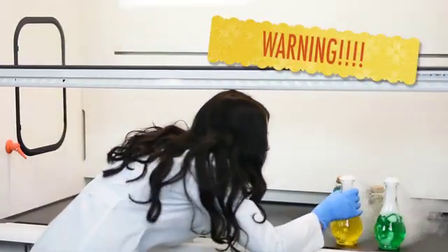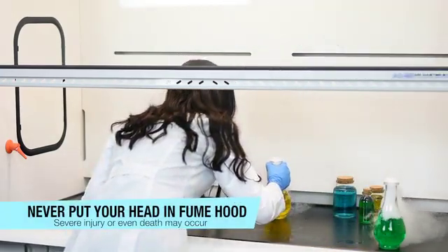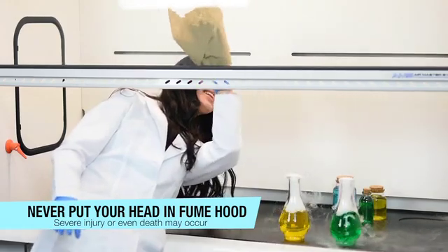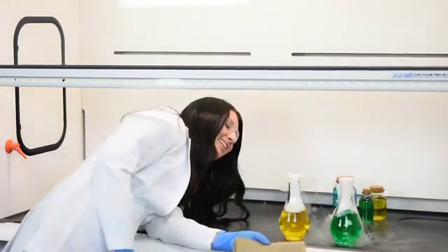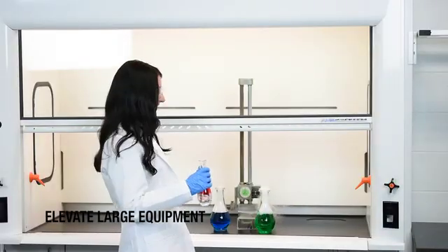Never put your head inside of a fume hood! Well, we are happy that Marissa is still with us.